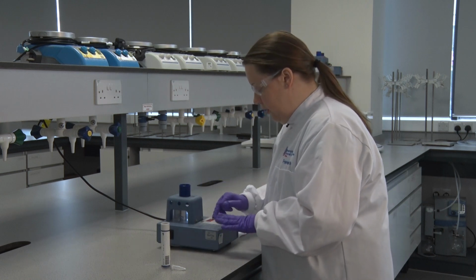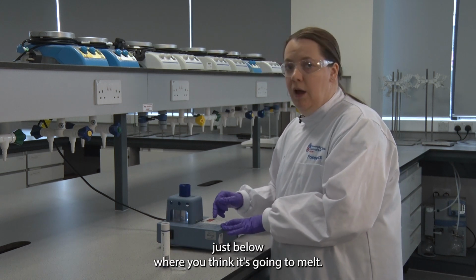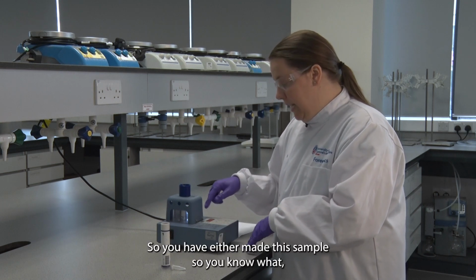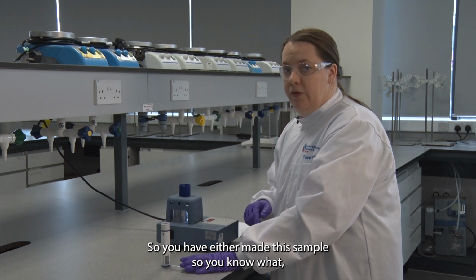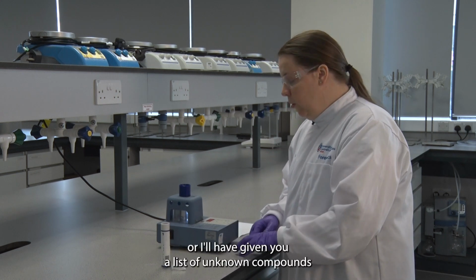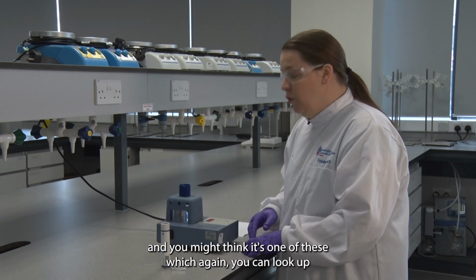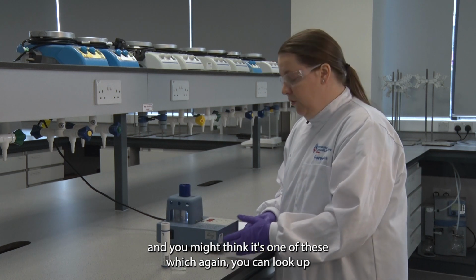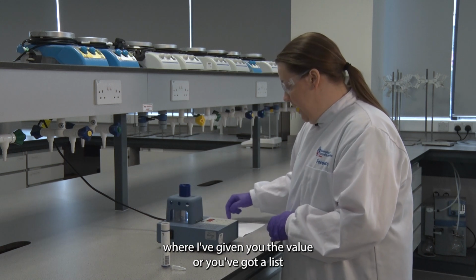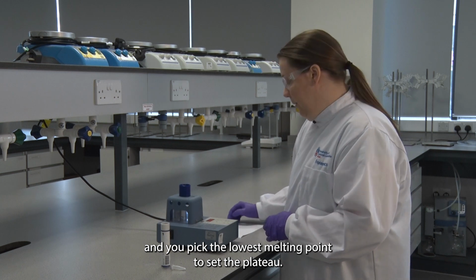Now you want to set the plateau, and this is a temperature just below where you think it's going to melt. So you have either made this sample so you know what it should melt at because you can look up the literature value, or I'll have given you a list of unknown compounds and you might think it's one of these, which again you can look up, or I've given you the value, or you've got a list and you pick the lowest melting point to set the plateau.